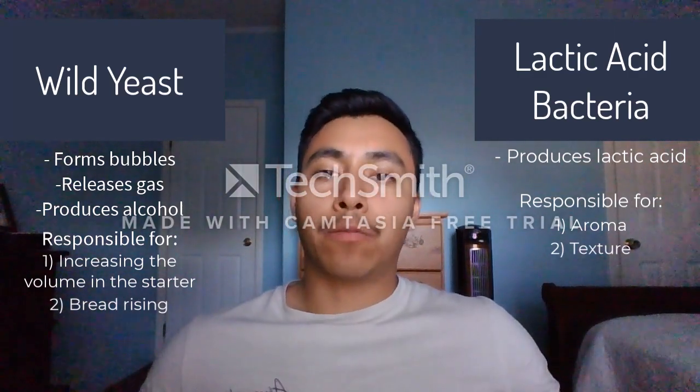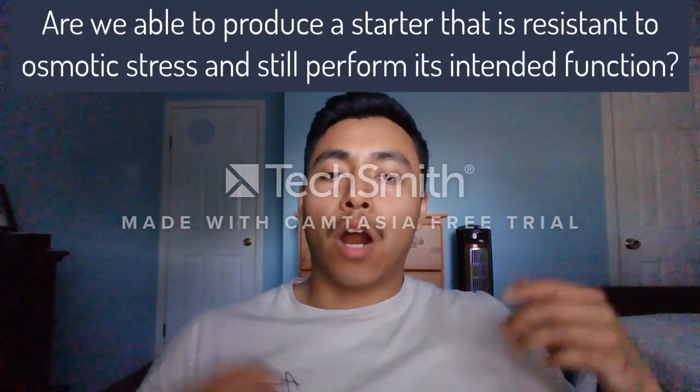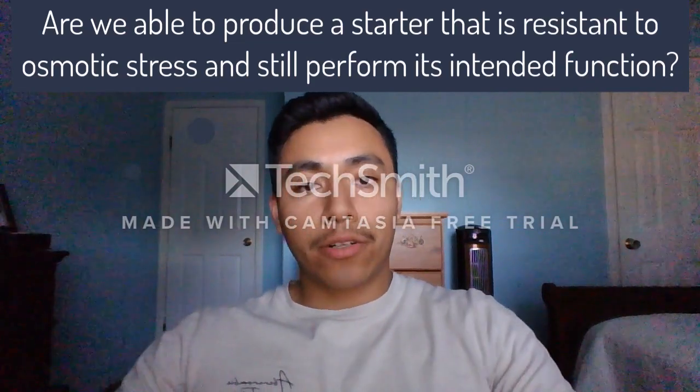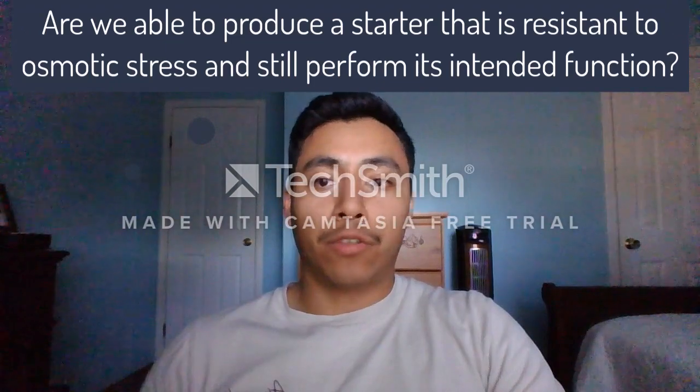Now on to the lab procedures and experiments. Every lab session, when we conduct experiments, we keep this question in the back of our heads: are we able to produce a starter that is resistant to osmotic stress and still perform its intended function?